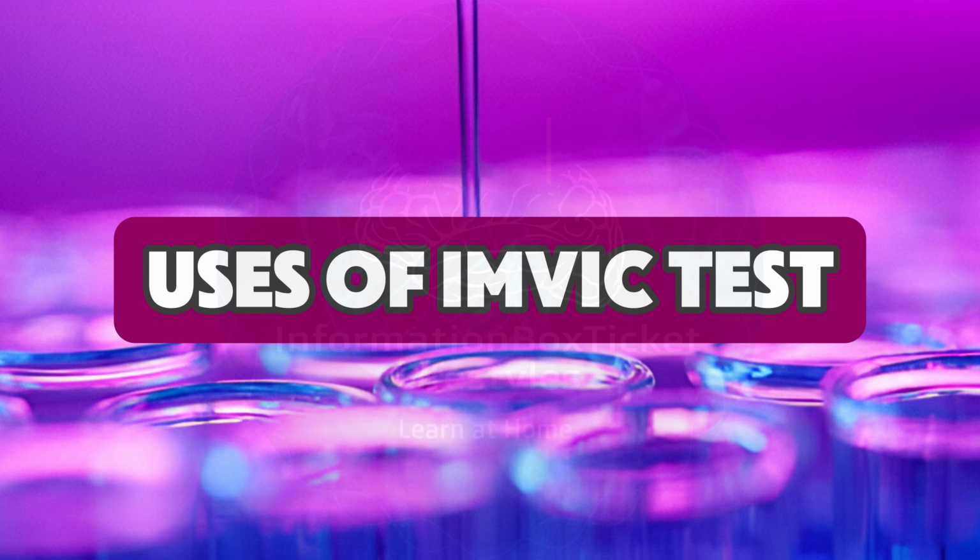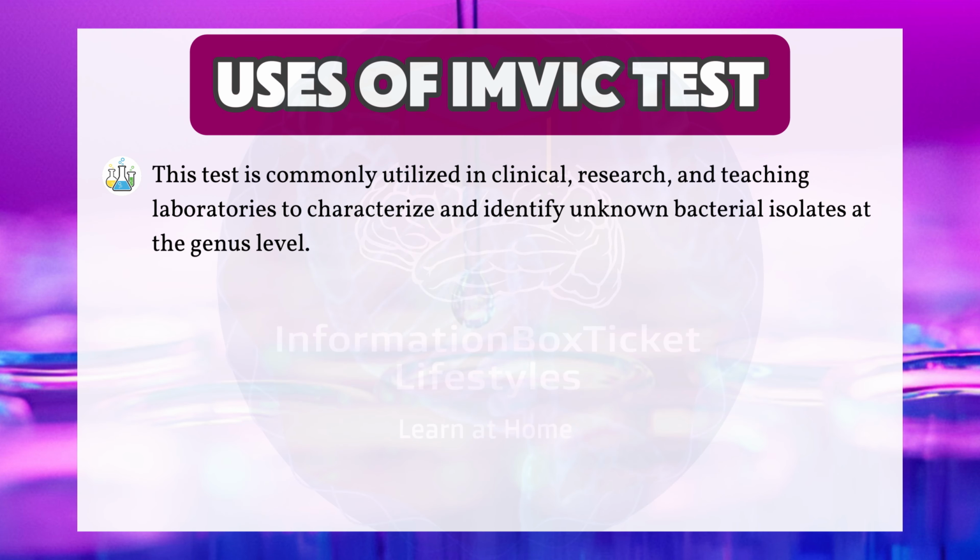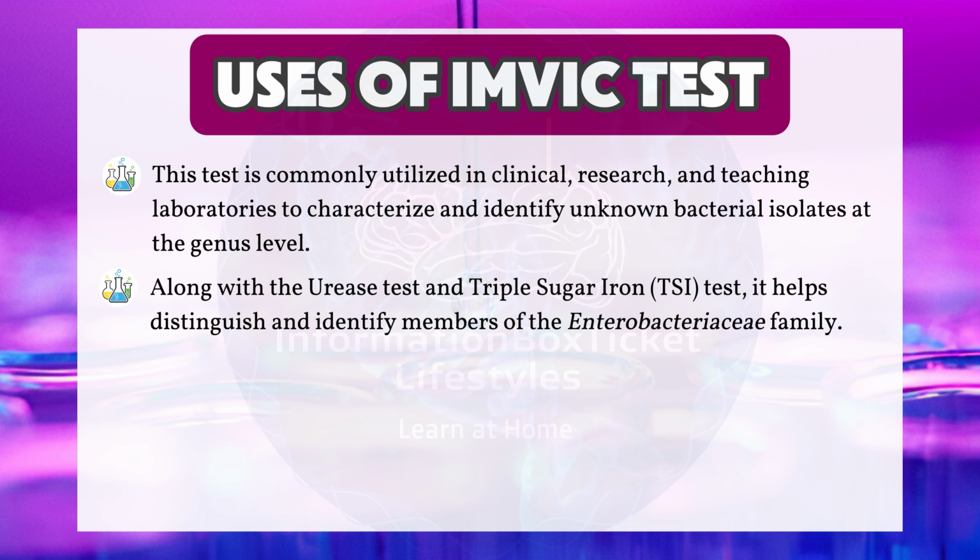Uses of IMViC test. This test is commonly utilized in clinical, research, and teaching laboratories to characterize and identify unknown bacterial isolates at the genus level. Along with the urease test and triple sugar iron test, it helps distinguish and identify members of the Enterobacteriaceae family.